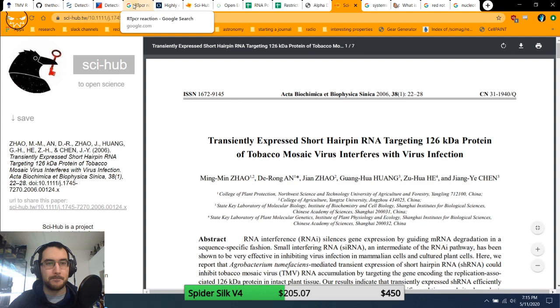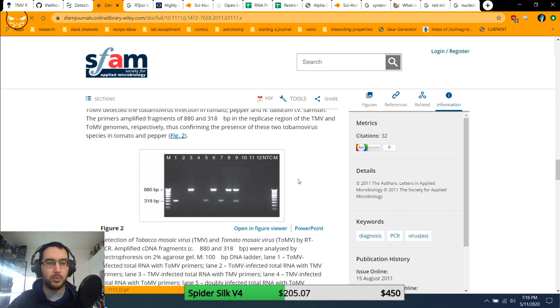This one. Here we go. So I'm going to order those primers. I'm going to do a tissue extract of my plants. And in theory, if it's the right virus, I should get a band of 880 base pairs on a gel after I run the PCR reaction. That'll tell me if I've got the right virus.